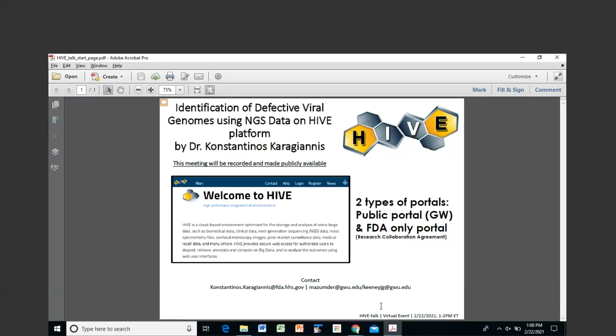We are excited to start these talks, which are about the HIVE platform and some of the tools and resources that have been developed and how they have been used and can be used. Today's talk is by Dr. Konstantinos Karagiannis, identification of defective viral genomes using NGS data on HIVE platform. This meeting will be recorded and made publicly available.